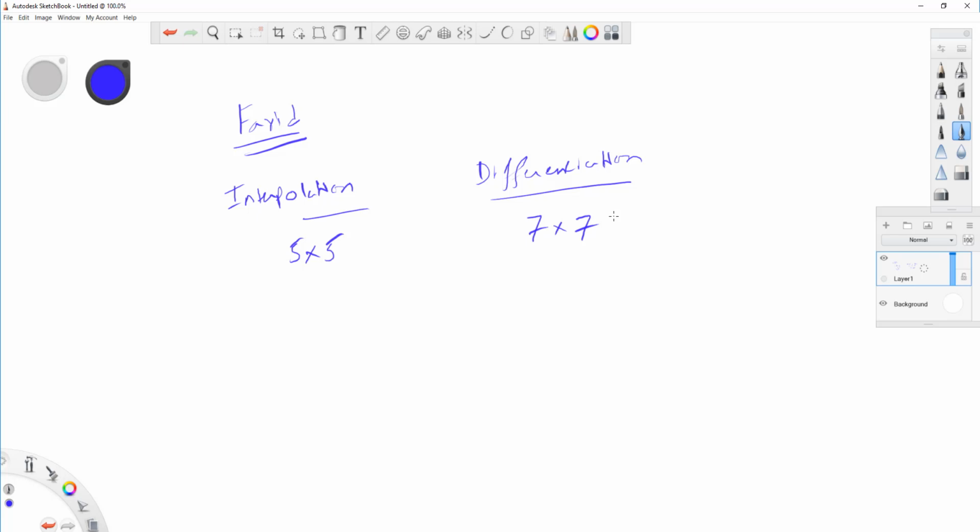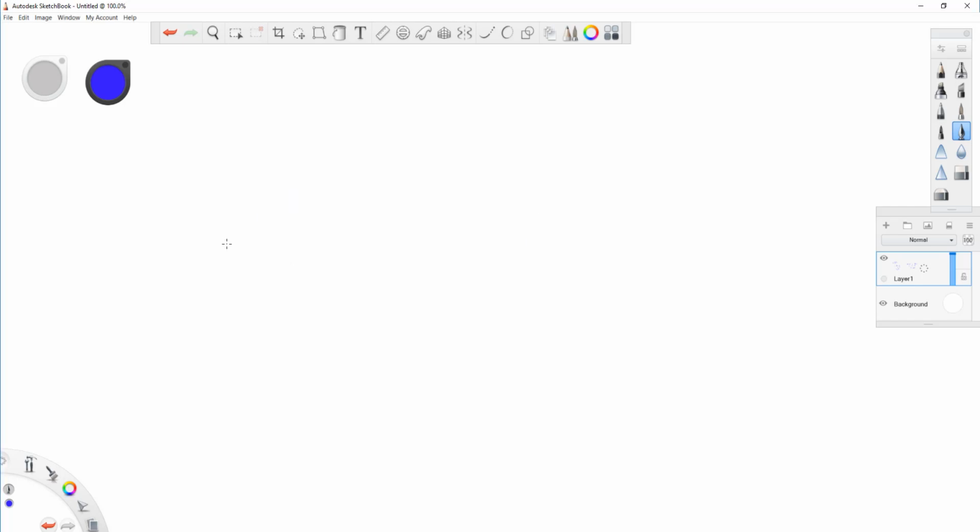And finally, we have Canny. Canny is again one of the most commonly used ones, so let me take another 30 seconds to a minute to explain what it is. Canny is a bit complicated because it's not just one convolution, it's actually multiple steps. Step number one is to apply a Gaussian filter. It smooths the image. Why do they do that? The primary goal is to remove noise, otherwise it can be a bit difficult. So that step is to remove noise.